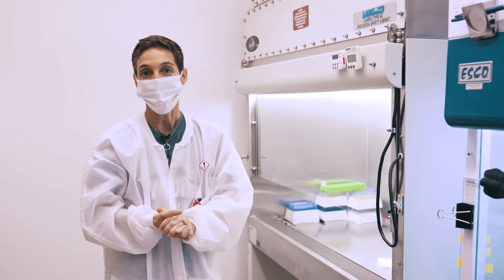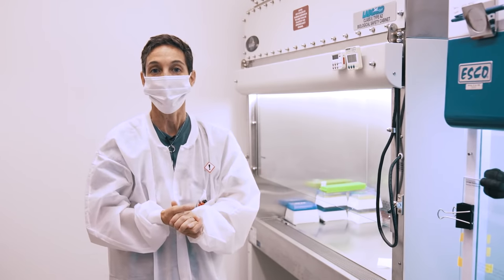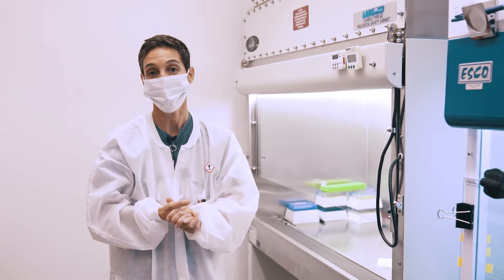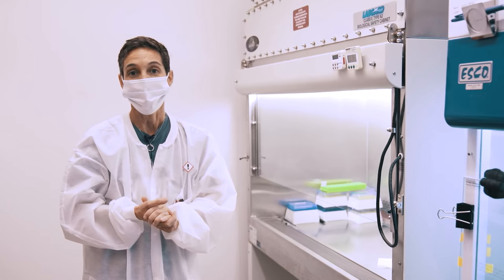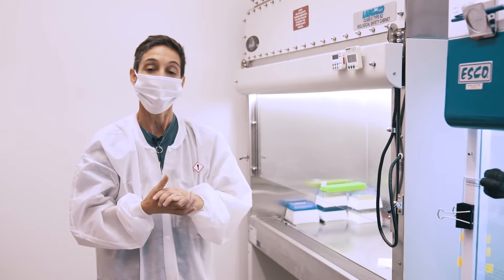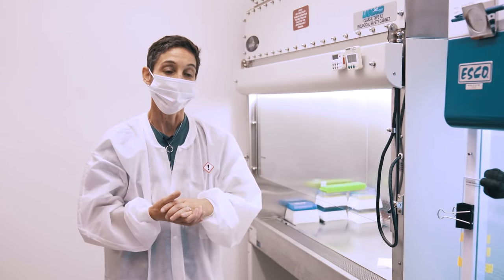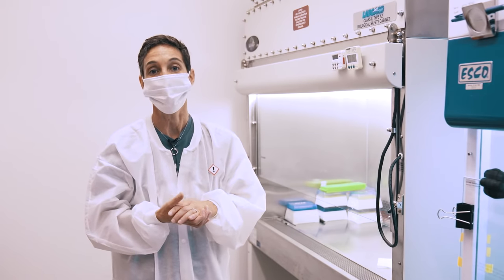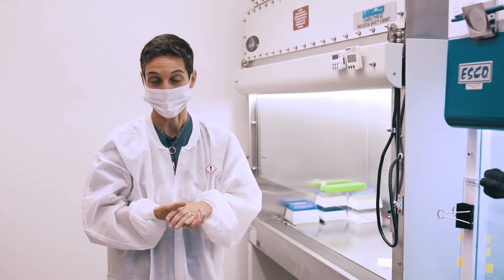Hi, my name is Lexa Skupum. I am a molecular biologist with the Virology Laboratory for the Center for Veterinary Biologics. Today I'm going to be talking about real-time PCR and doing a demonstration of how to set one up as well as how to do the data analysis.